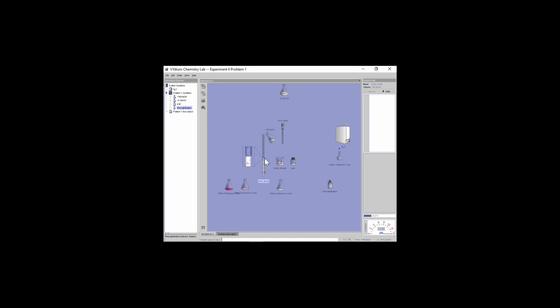It's at the 30 ml mark. Maybe I'll refill it with about 20 or so. Now I'm back up to the 11 mark. You can even fill it up some more. Oops. Okay. So now it's overshot. Let me actually try that again.